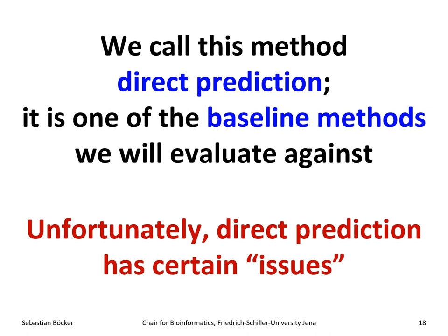Baseline method, for those of you who are not familiar with the term, doesn't mean that this is something stupid or not a very smart method. In fact, I would argue that what I just presented you is the best direct prediction method that you could currently come up with, because it gets all the smart ideas from CSI:FingerID, the multiple kernel learning, and so on and so on. All of that is in there, so I don't think you could come up with a better direct prediction method, or if you can, we'll actually use that to improve CSI:FingerID as well.